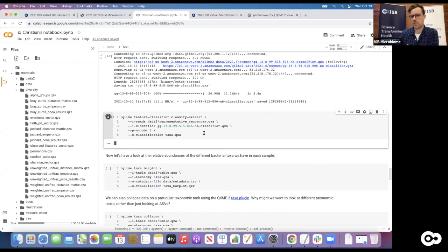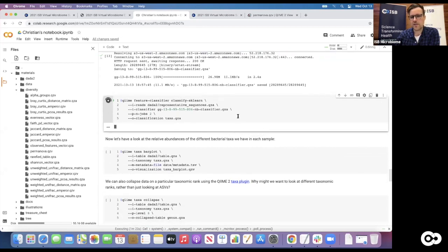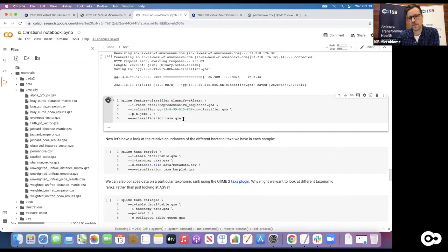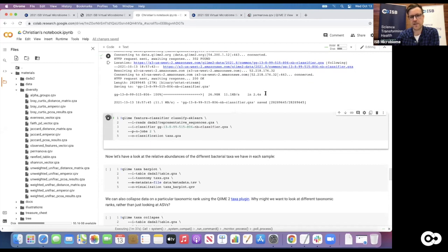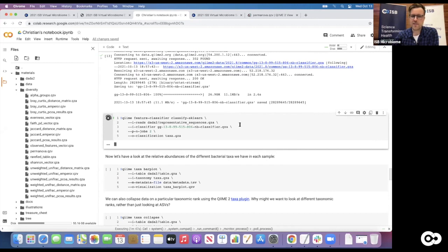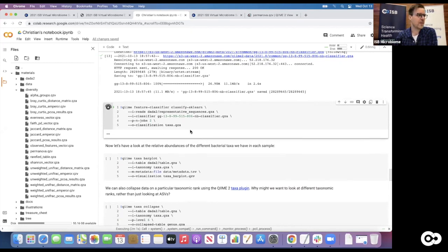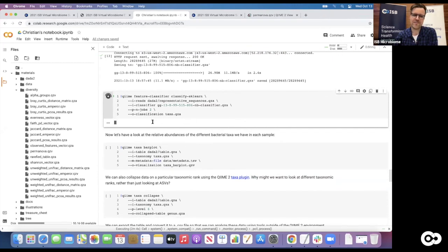The algorithm takes that into account - they have classifiers for each taxonomic level and sometimes it will be able to assign something, sometimes it won't. So you get different qualities of assignments. For very well-known organisms whose diversity is captured by the variable region, it might actually work well; for others it doesn't. There's definitely an advantage to the analysis we did before, looking at the data based on amplicon sequencing variants without looking into what taxons they came from - because we still use all our data. Here, any analysis based on assigned taxa is limited to those where we can actually assign a good taxonomy.